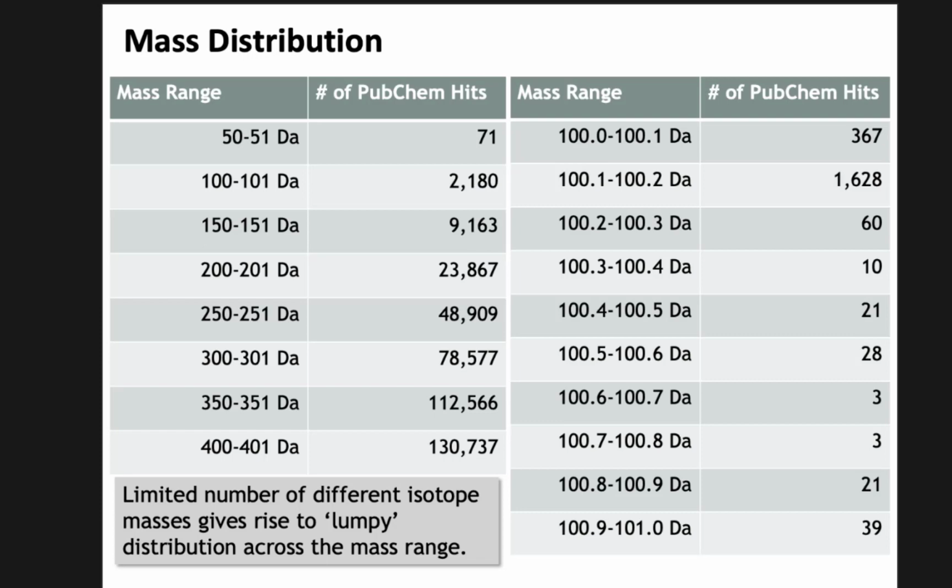Well, what's the monoisotopic mass of hydrogen, carbon, oxygen? Roughly 12, 1, 16, 14. So what is happening here is that the atom masses are discrete. And if you want to achieve a certain mass, then you need to find the elements that actually add up to this mass. And if they're almost all integral masses, then it's very hard to get numbers that are far off.